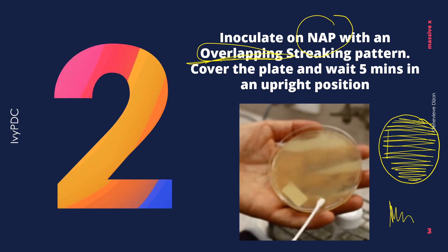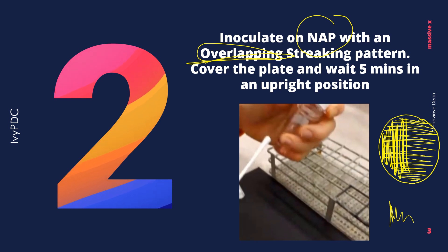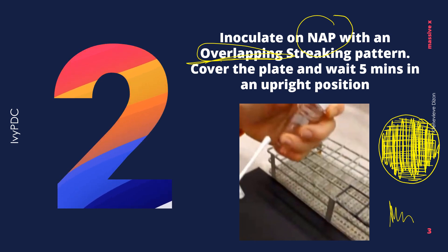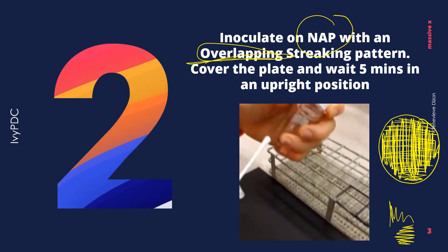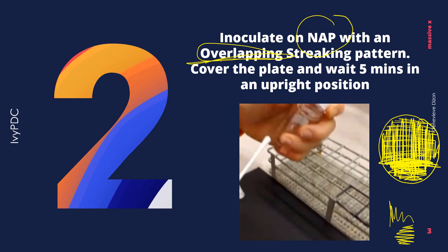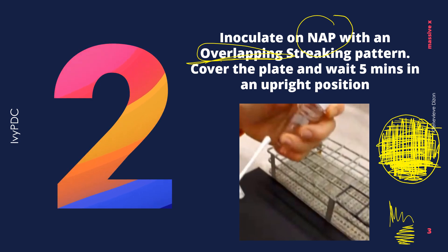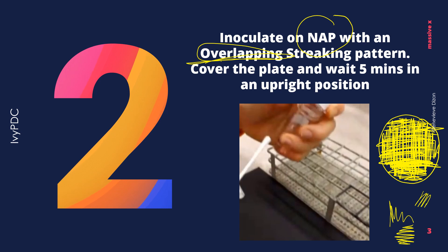After that, another streak is given perpendicular to your initial streak, going in this direction. From here, cover the whole plate making sure that there are no spaces. The third streak is given in another perpendicular manner again — zigzag — making sure that there are no spaces in between using the same swab. That is your third streak, and the fourth streak is done on a diagonal basis.